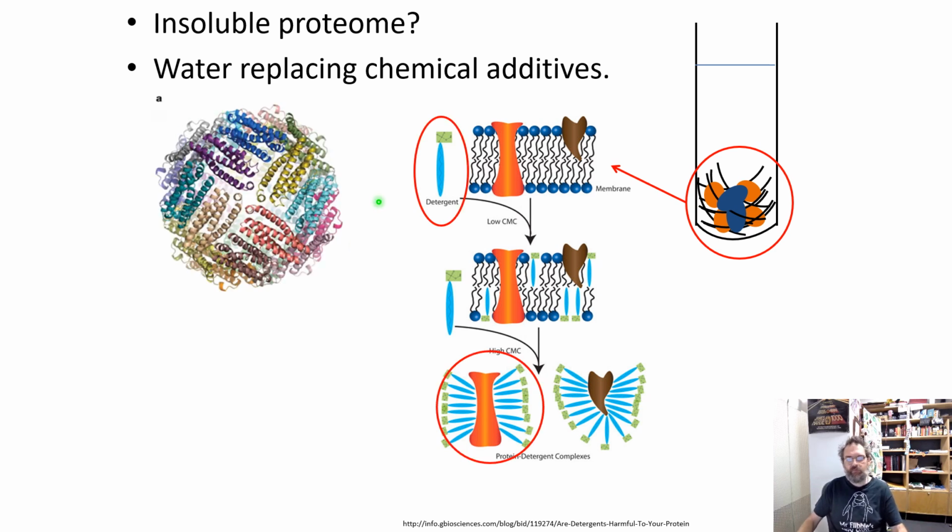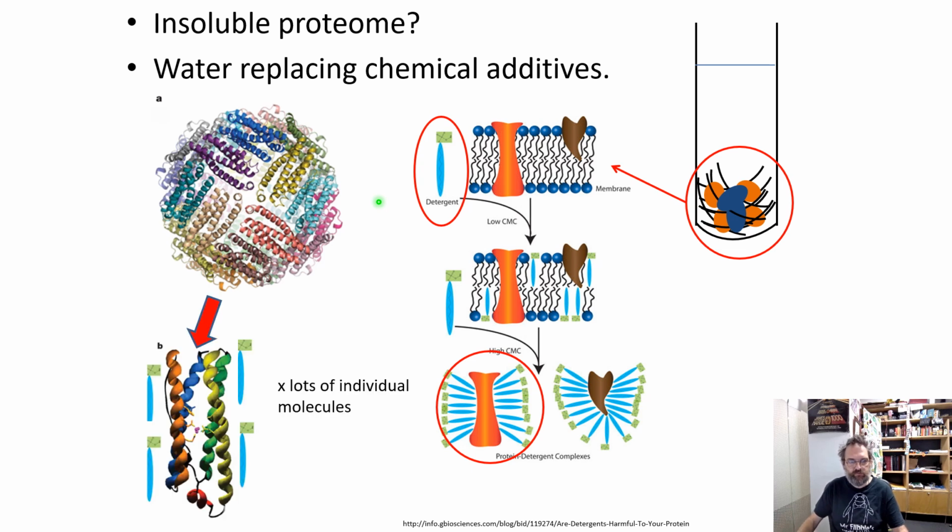So, not quite sure why I've drawn that ball. But what you're doing here is that you've got these balls of protein that are insoluble, and therefore what you can do is start to disrupt the individual molecules of the proteoforms and coat them with these surfactants to be able to get all of the molecules suspended singularly in solution, so that you can then isolate all of the molecules of a particular proteoform to be able to analyze.